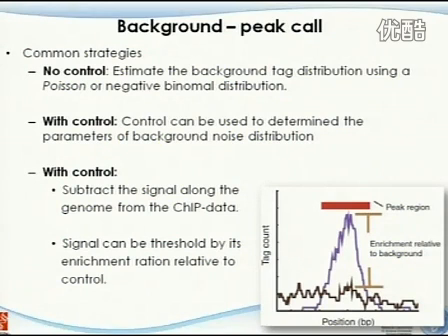Well, it doesn't really matter, because when you look at the distribution, you use each window as a unit. If there's one window that has 10,000 reads, let it be, it would still just be one window. By the end of the day, your background distribution estimation should be based on the histogram of the number of reads in each individual window.